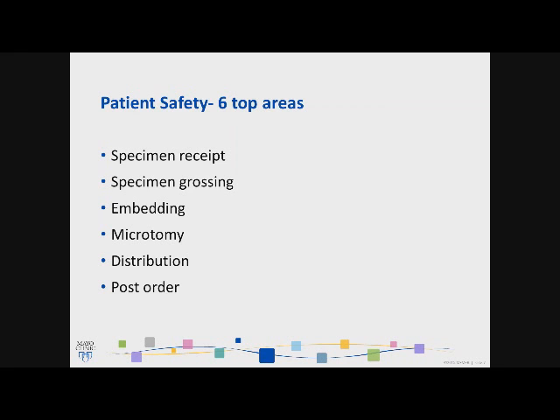We went into the surgical suites. We gathered the samples by ourselves. We wrote on all the cassettes. We did everything as fast as we could to get everything out, and there really wasn't a focus on quality. Well, I don't want to say quality, but a focus on ensuring that everything was as accurate as possible, and anything that was done wrong was a direct implication on the tech. It wasn't about the process. And again, I want to emphasize that it's not always the person's fault.